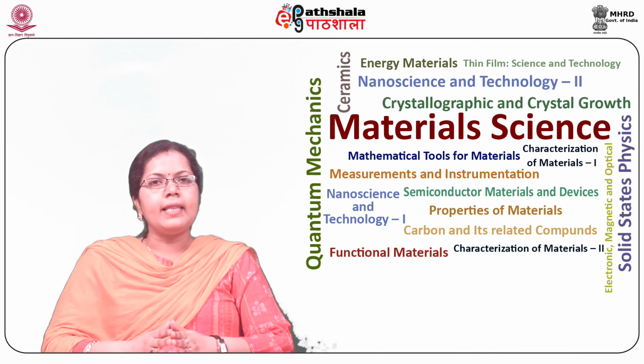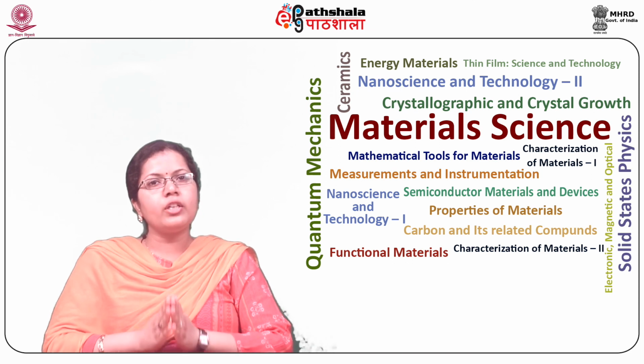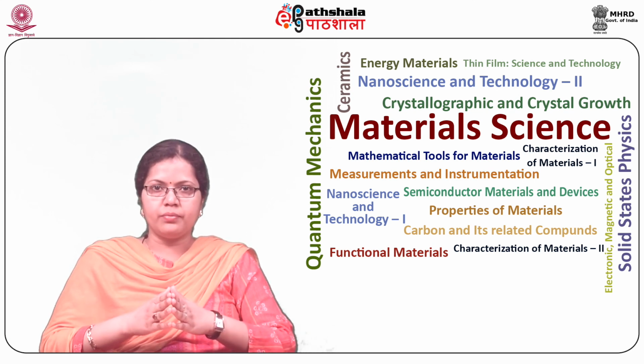So students, let us summarize what we have learned in this module. We discussed dispersion staining microscopy, in which we covered the exemplar materials and its applications.